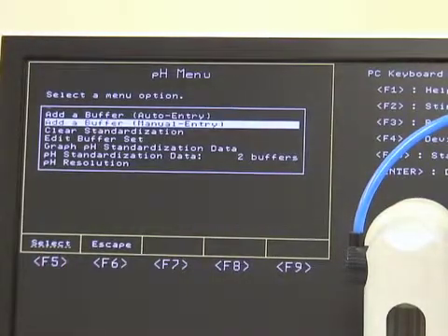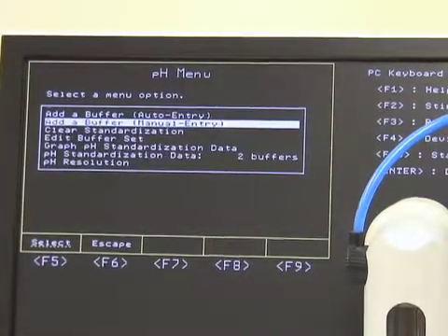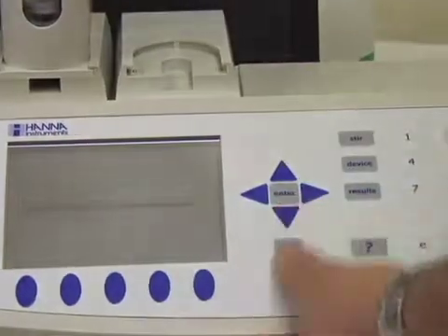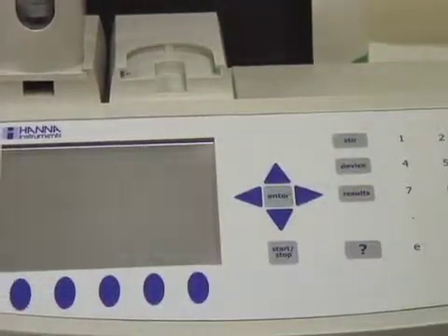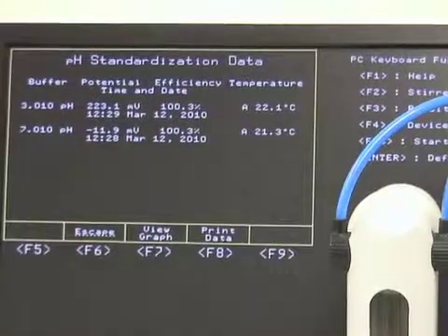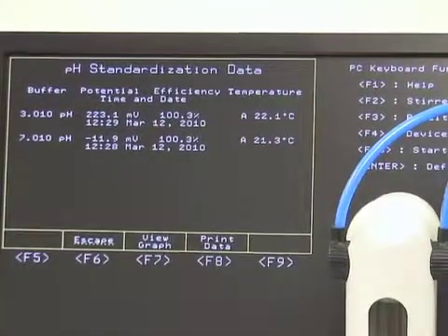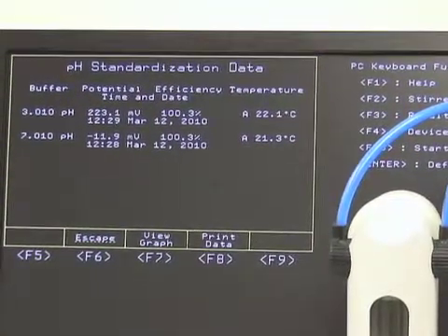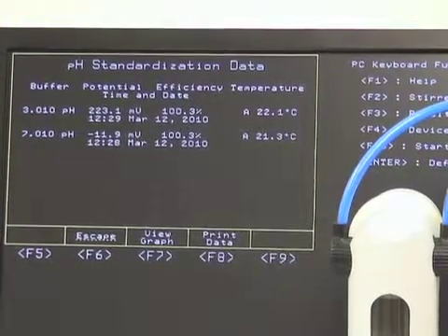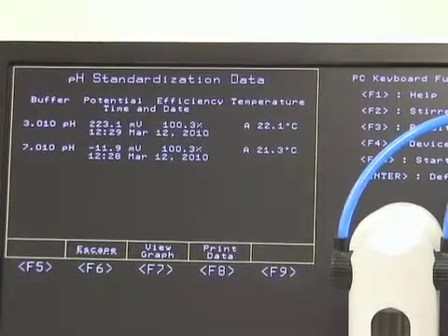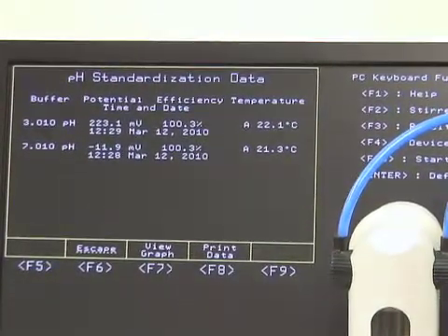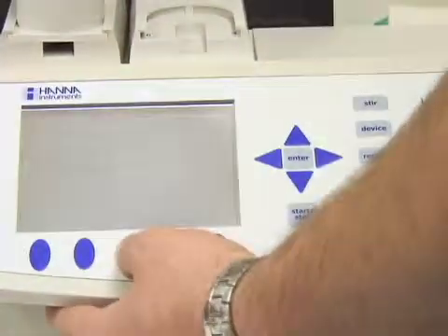And there we go — we now have two standardization data points. This is where you can check whether your crew calibrated the probe last week as they're supposed to; here's where you can find out. The middle button, F7, will be view graph — this will show your standardization curve.